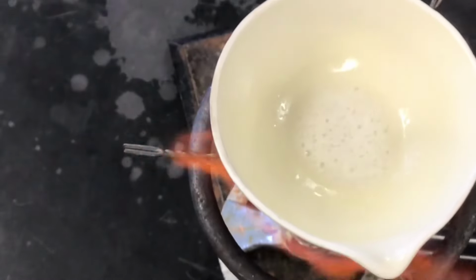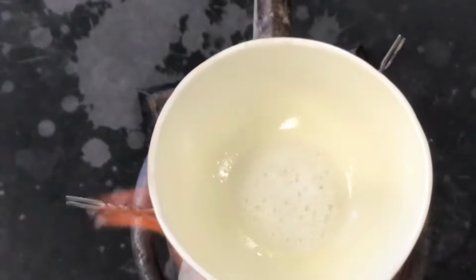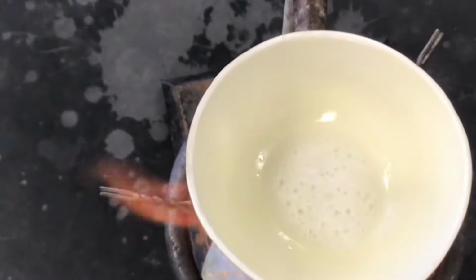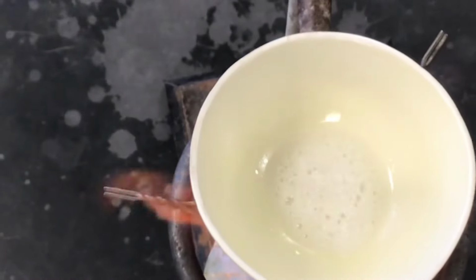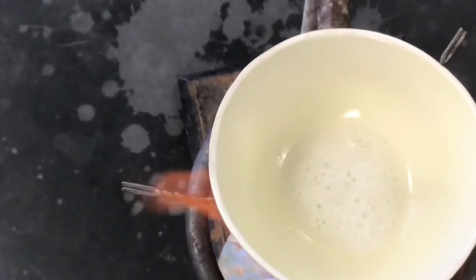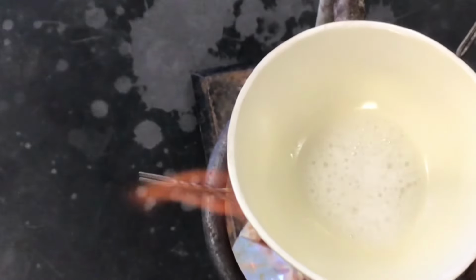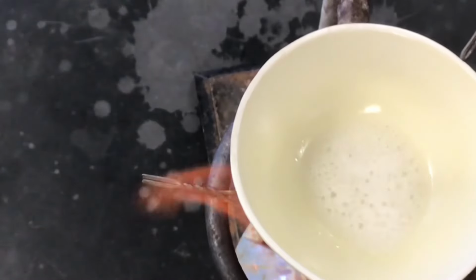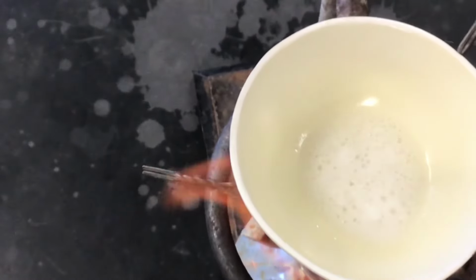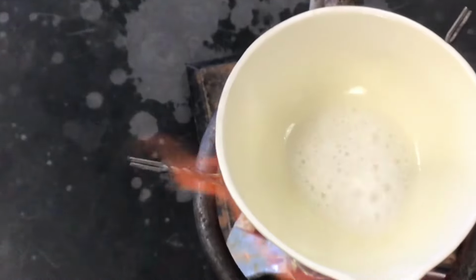Okay, once that oxygen goes, it's going to solidify pretty fast. Quite a bit of oxygen in there.